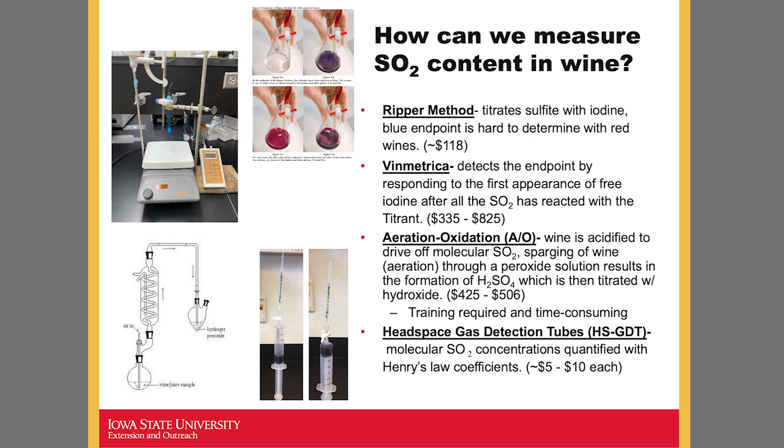And there is a lot of connection that has to be really tight, making sure the gas is not going outside and is really going into the tube. So it's really easy, I would say cheap method, but it has a negative aspect where that's not really reliable so far. So there is still some work that needs to be done on this method.